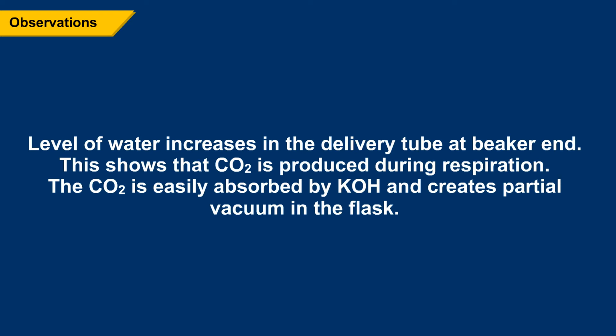Observations: level of water increases in the delivery tube at beaker end, which shows that CO2 is produced during respiration. The CO2 is easily absorbed by KOH and creates partial vacuum in the flask.